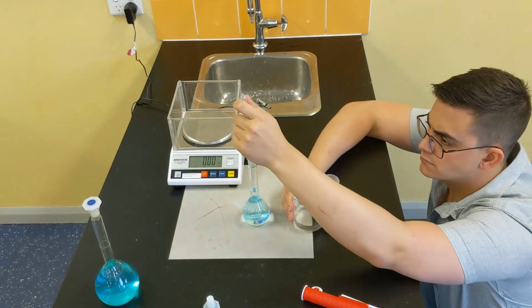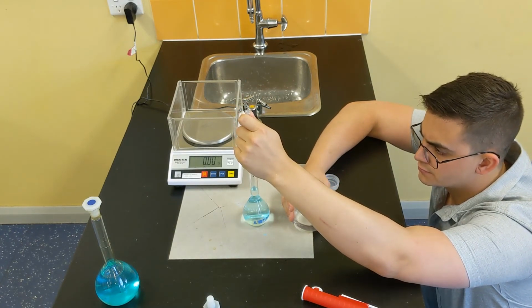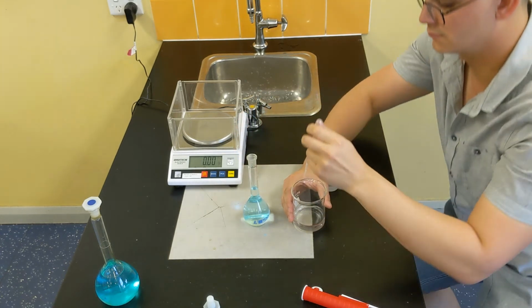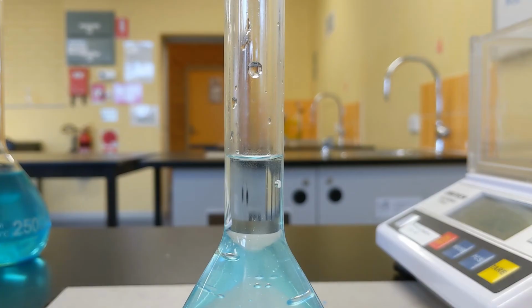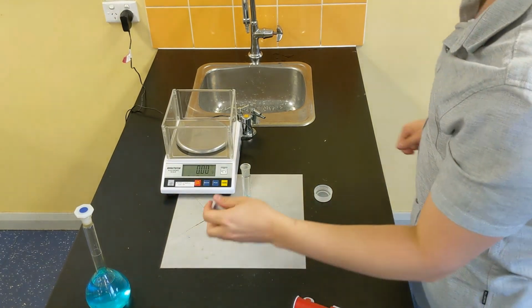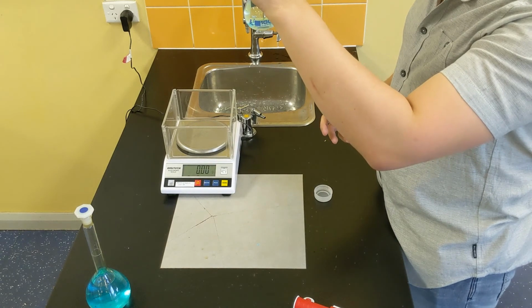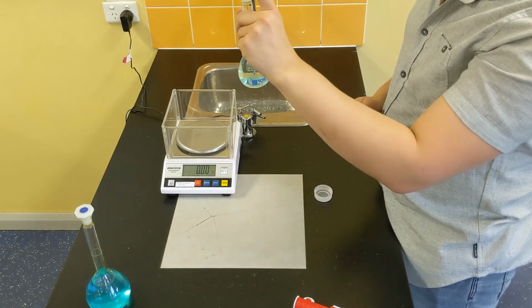So I'm going to fill drop-wise, making sure again that the bottom of the meniscus, the curved part of the top surface of the water, is exactly in line with the mark that on this flask measures out exactly 100 mils. Hopefully we can see there quite clearly that the meniscus has lined up exactly. And all I'm going to be doing at the end is again capping, holding the cap down, and then inverting to mix to ensure that the concentration is evenly distributed all throughout the flask.